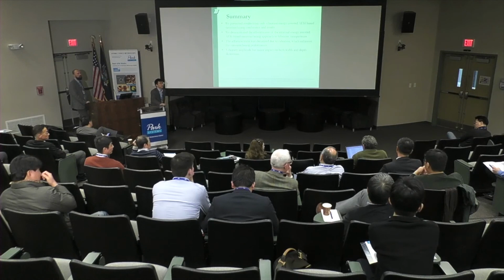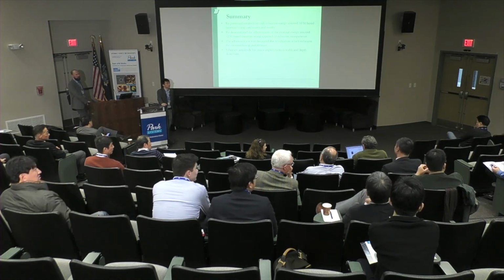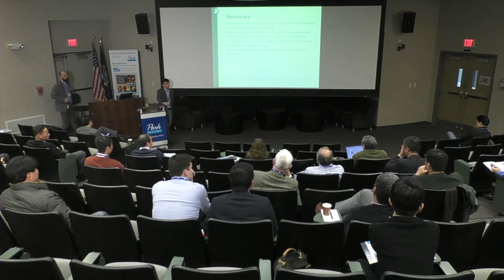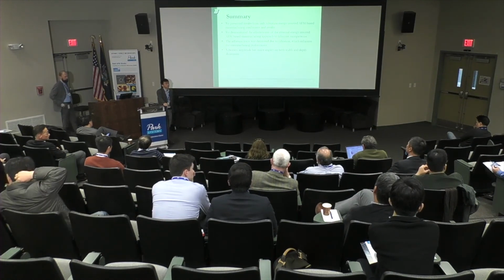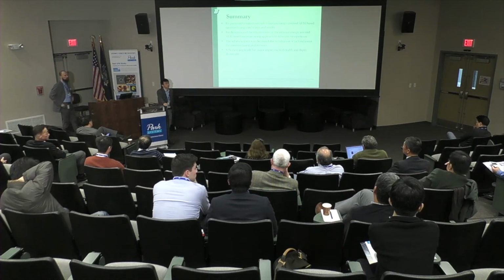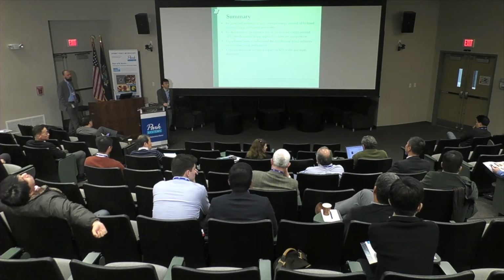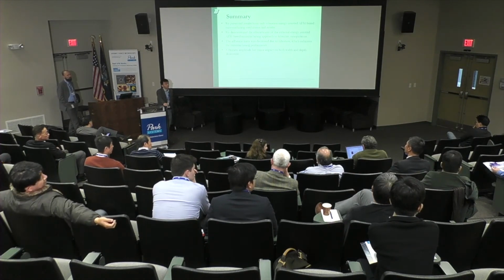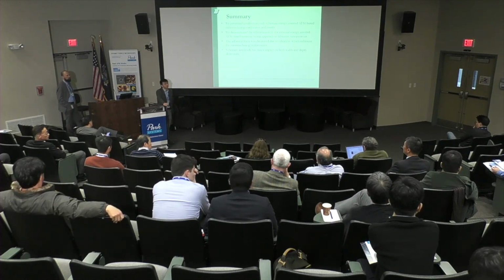It's very impressive results. I have two questions. One is I noticed the patterns have trenches, but there's also material on the side of the trenches. Have you tried post-processing? Is the material modified such that its solubility changes, so that you can remove those materials? That's question number one. The other is for the diamond-like carbon. Have you tried fluorinating the surface, to see whether that would make it last longer or give better machining performance?